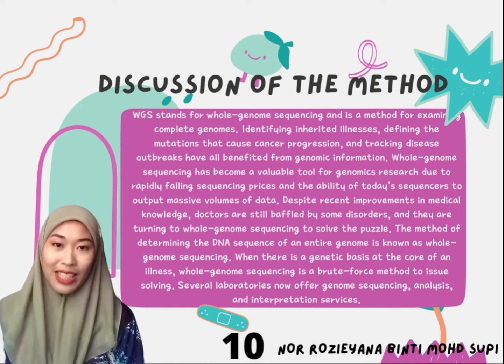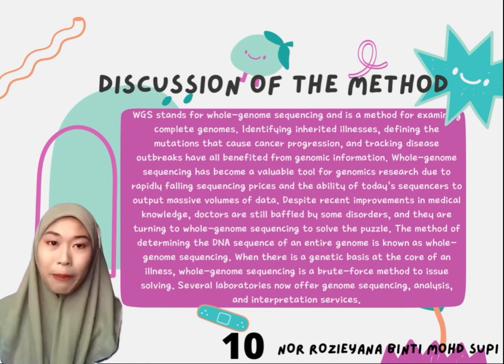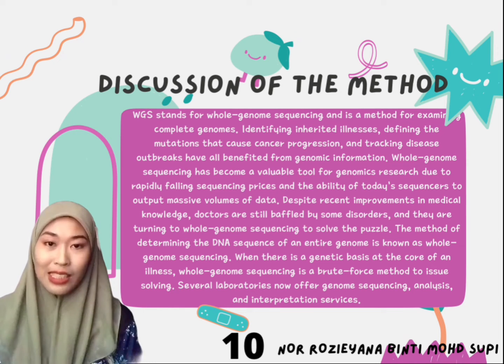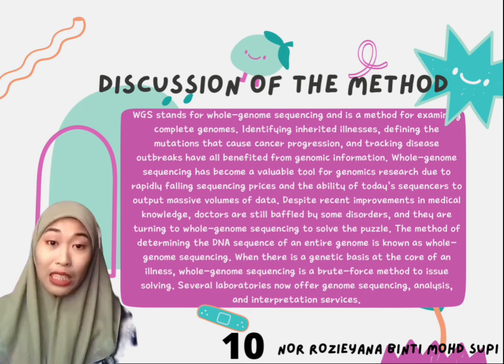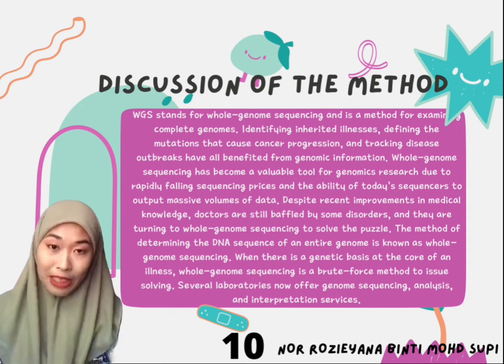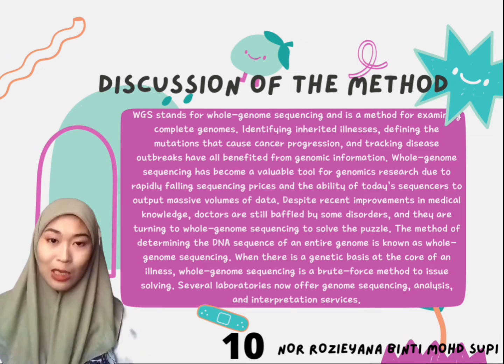Whole genome sequencing has become a valuable tool for genomic research due to rapidly falling sequencing prices and the ability of today's sequencers to output massive volumes of data. Despite improvements in medical knowledge, doctors are still baffled by some disorders, and they are turning to whole genome sequencing to solve the puzzle.